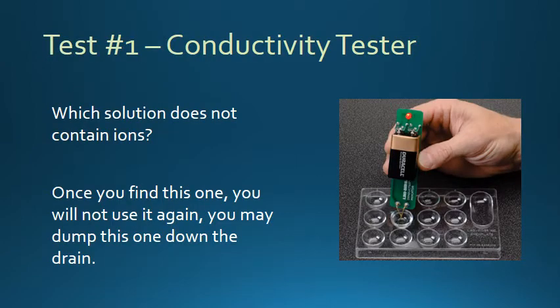The first test you're going to do is called a conductivity tester. Go ahead and use a well plate for this. I know the red is kind of hard to see, sorry about that. Your tester will look just like this one.